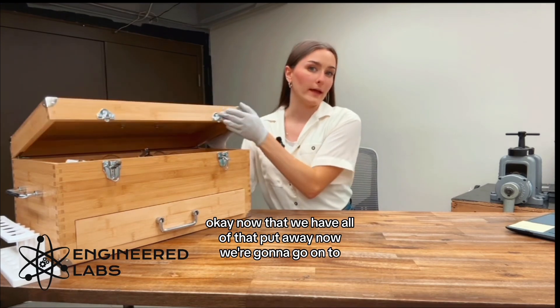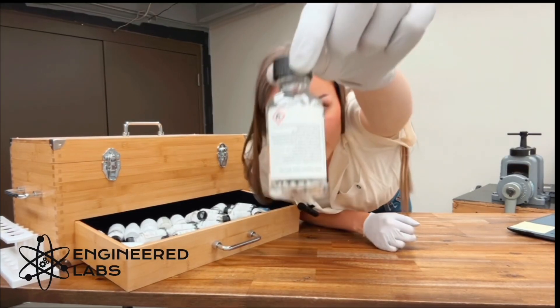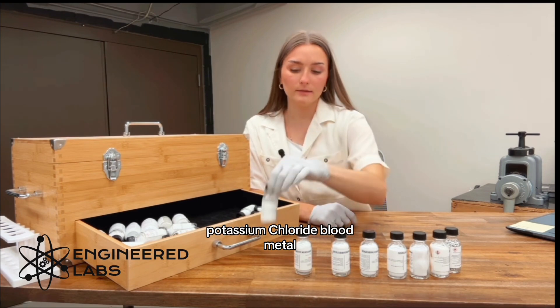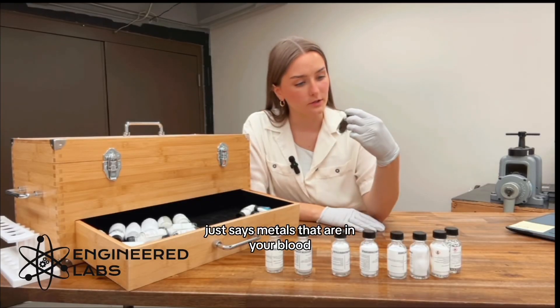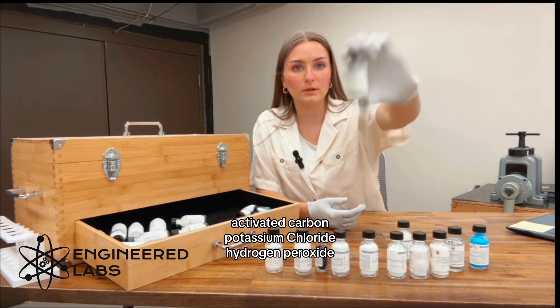Now that we have all of that put away, we're going to go on to the chemicals that are included in this chem set. We have got magnesium, sodium borate, boric acid, sodium chloride, sodium carbonate, sodium metabisulfite, trisodium phosphate, potassium chloride, blood metal, copper sulfate — I love this one because it's so pretty — activated carbon, potassium chloride, and hydrogen peroxide.